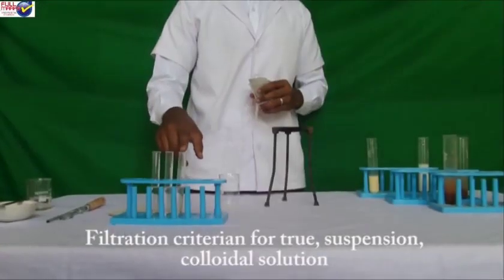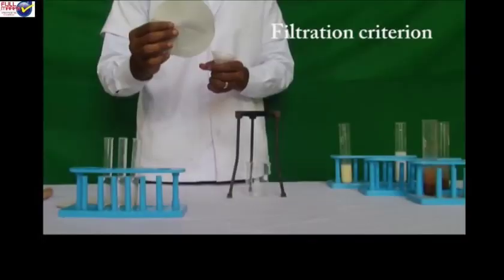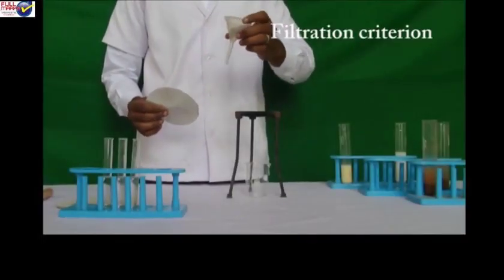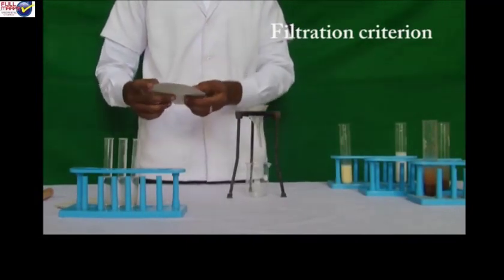To check filtration criterion, take a tripod stand and place a funnel over the tripod stand. Fix the filter paper in the funnel and check for the filtration criterion.